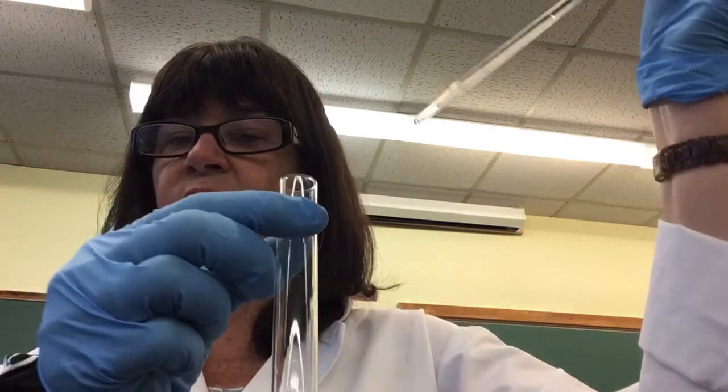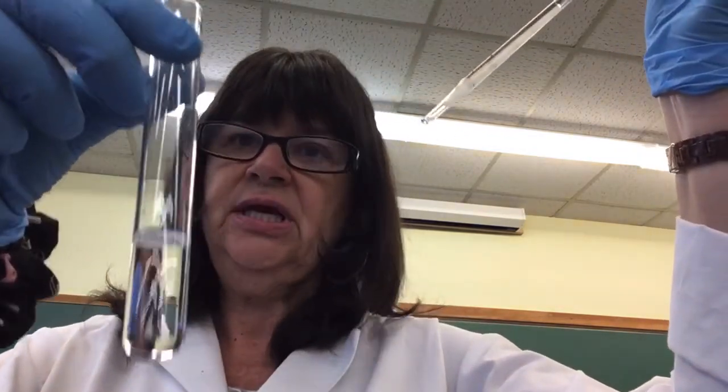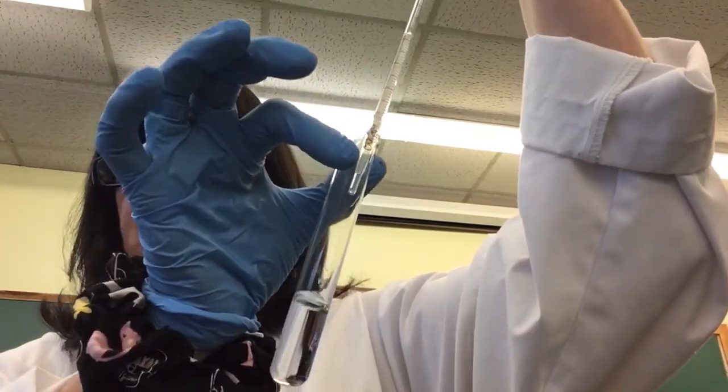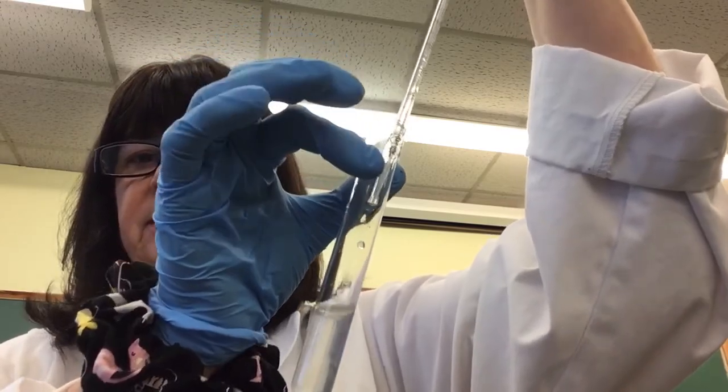I'll show you one example of adding 0.5 mL of mitochondrial suspension — this one is going into the reagent blank. I measure 0.5 mL with a 1 mL graduated pipette, pour it in, add some parafilm to the top, mix it up, and then pour it into a spec tube like this smaller one.